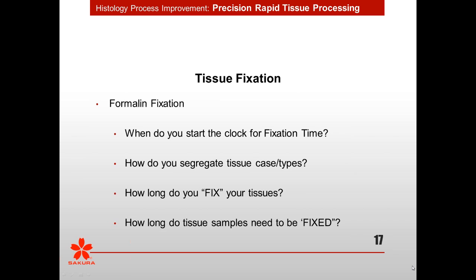Now here's the controversial part. You've seen the papers, oh, it needs to be 8 hours, it needs to be 12 hours, it needs to be 24 hours. But what are you actually accomplishing? Are you needing to accomplish complete cross-linking, or are you looking at stabilization of your artifact?